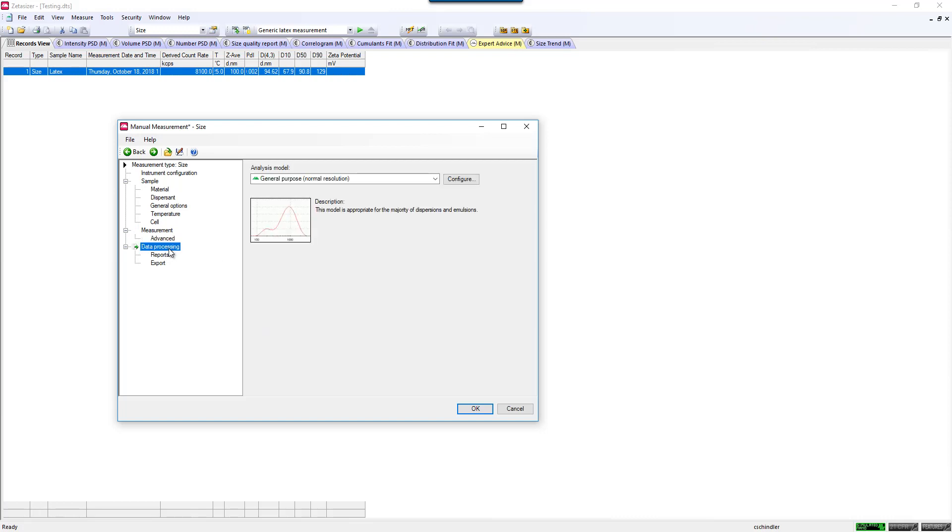On the data processing, in general purpose mode, this is the most conservative treatment of noise. There are other models that you can select here as well if you work with multimodal samples.